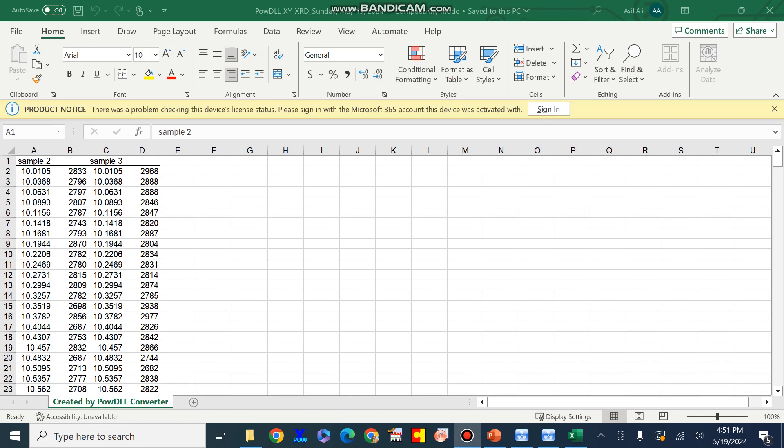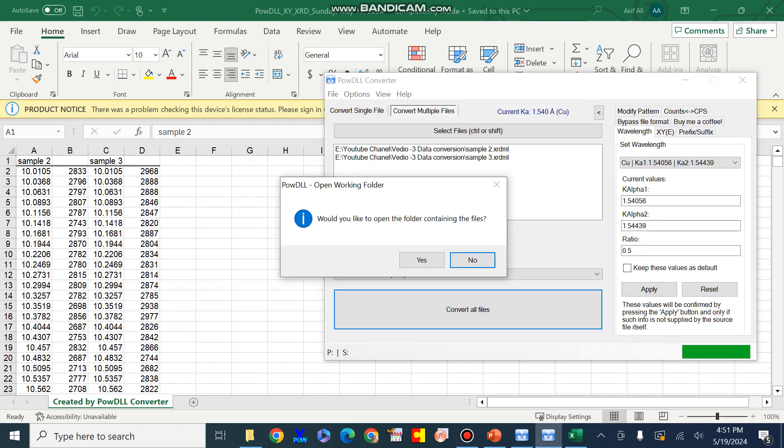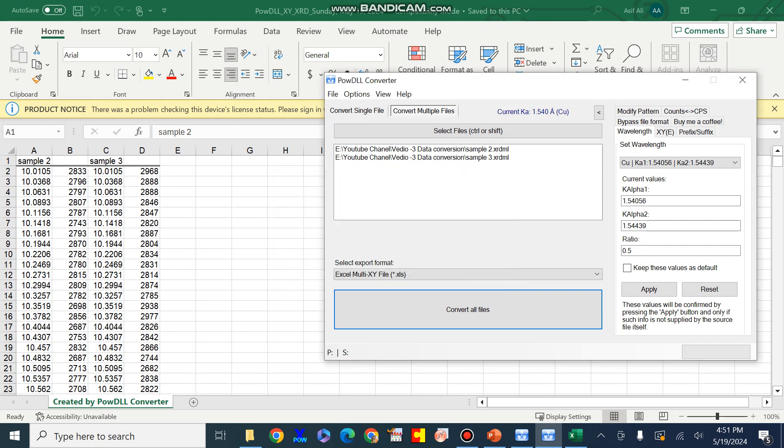It is a simple way to convert your raw data file from one form into another form using this simple, free-of-cost, and easily available software — PowDLL. Thank you.